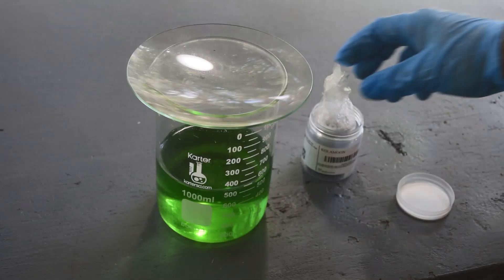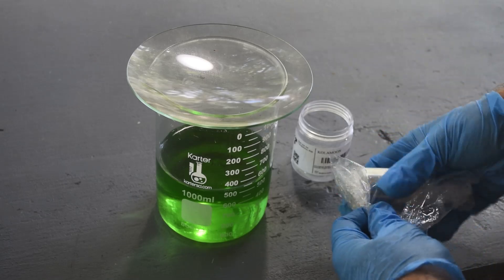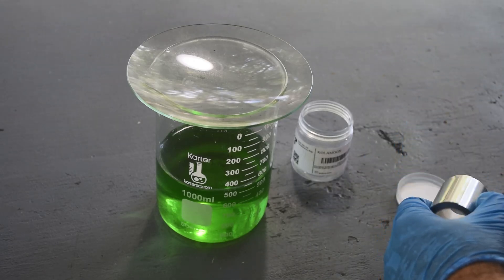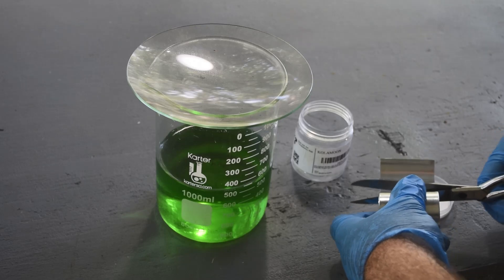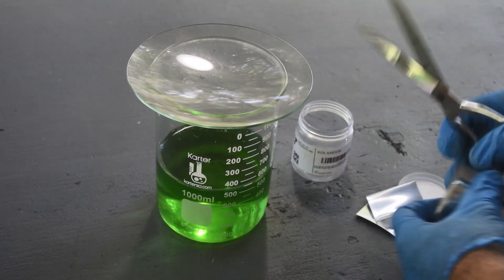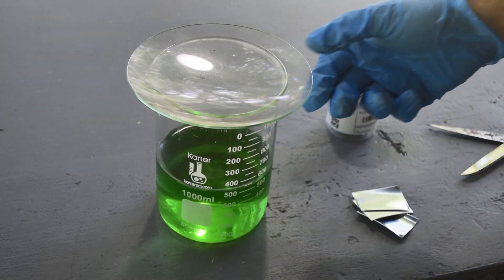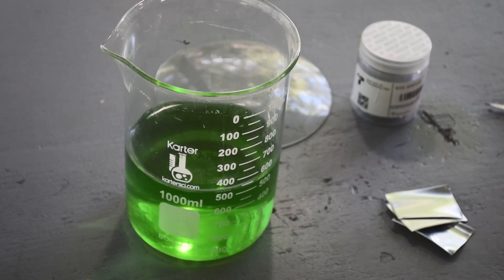I've got some pure zinc here in the form of a roll of zinc strip. Let me get this unwrapped and cut some strips off and drop them in to see what happens. This stuff's thicker than I thought — maybe that's good. I have two more rolls of this by the way, but maybe there's enough in this one roll. I don't think there's that much metal in here, so we should be able to cement it out pretty easily with just what I've got.